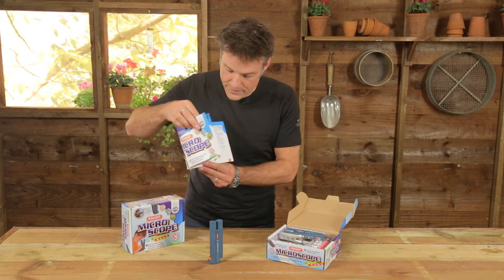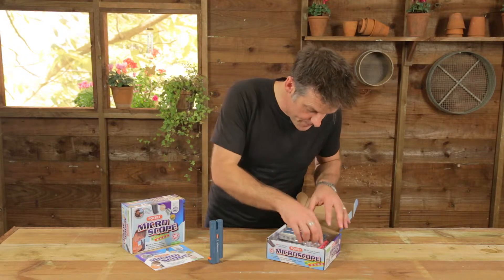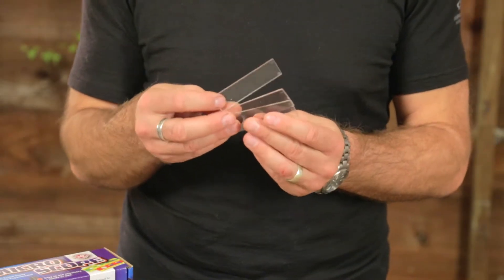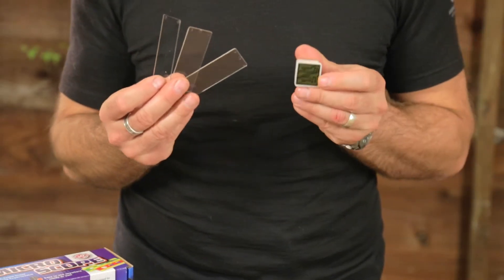The kit also comes with lots of little vials for you to collect your specimens in. We've got a bunch of slides in there and you've got some little covers as well, so you can make up your own little presentation slides.